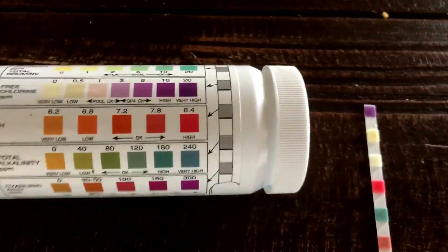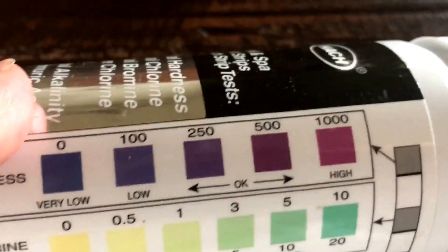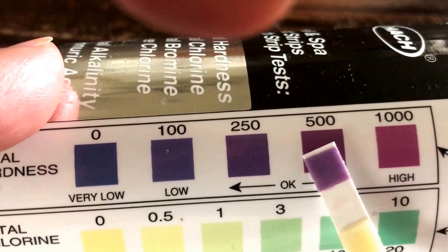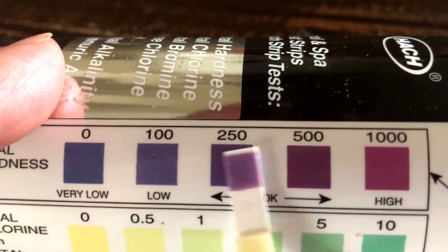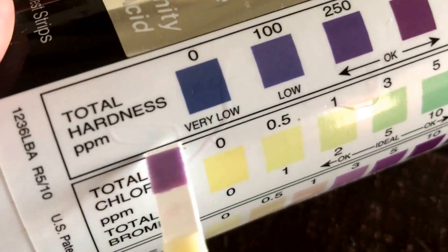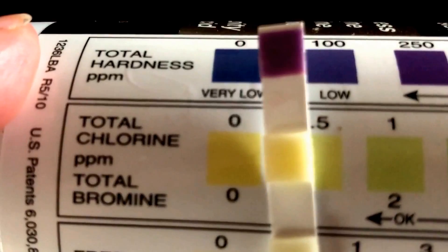I'm going to show you how to read this properly. Starting with the top part right here — sorry, I'm doing this by myself and it's really hard to hold the bottle and the phone at the same time. So this is my total hardness. All you have to do is match the strip to the first section. You hold the strip alongside and match the color — the closest match looks like it's somewhere between here and here. This is for total hardness in ppm, which stands for parts per million. My total hardness seems to be okay.